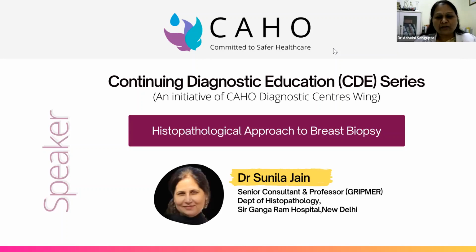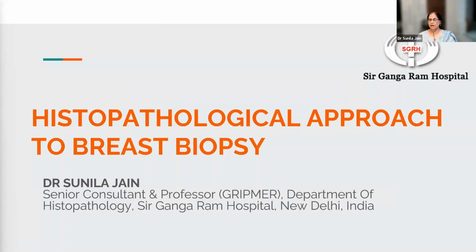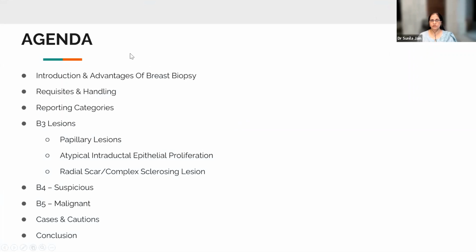So I think Dr. Sunila Jain, could you please deliver your talk? Thank you. Today my topic is the histopathological approach to the breast biopsy, from the biopsy to the diagnosis. Till the biopsy level, we have already finished. Now, how to approach the breast biopsy which we receive in the pathology department. So this will be the agenda. I will not be going through it in detail.